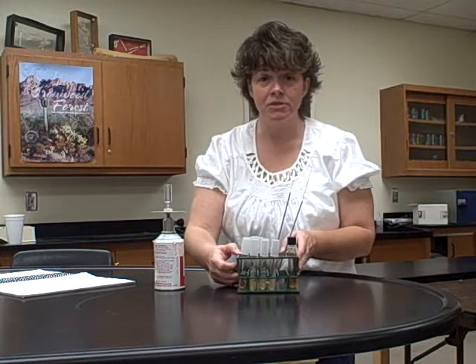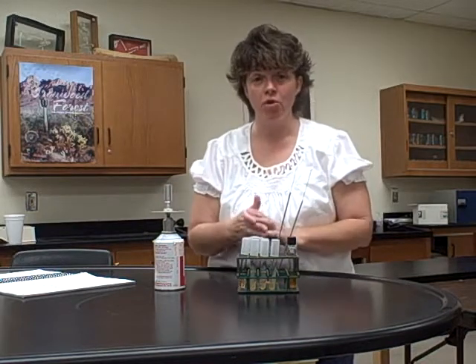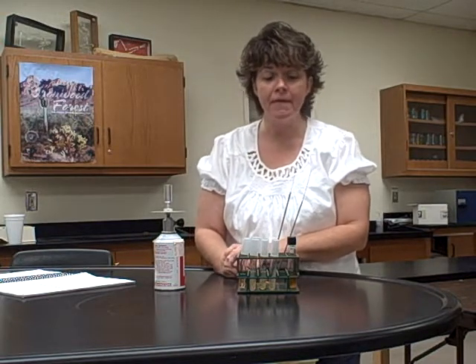Now today I'm just going to pretend I don't actually have any bacteria here. I'm not going to run the flame or wear goggles or anything like that. However, you know that when you're in class, if there's a flame going and you have your bacteria that you're using, you're going to be wearing goggles and gloves.